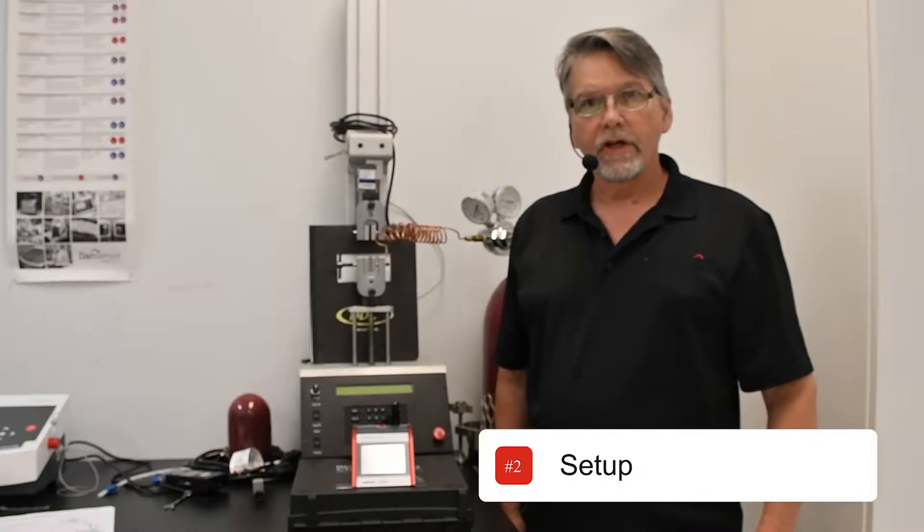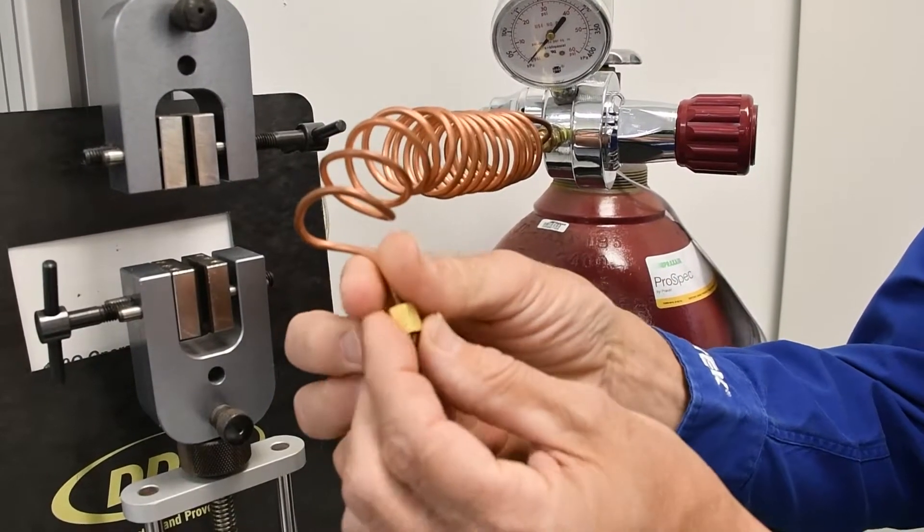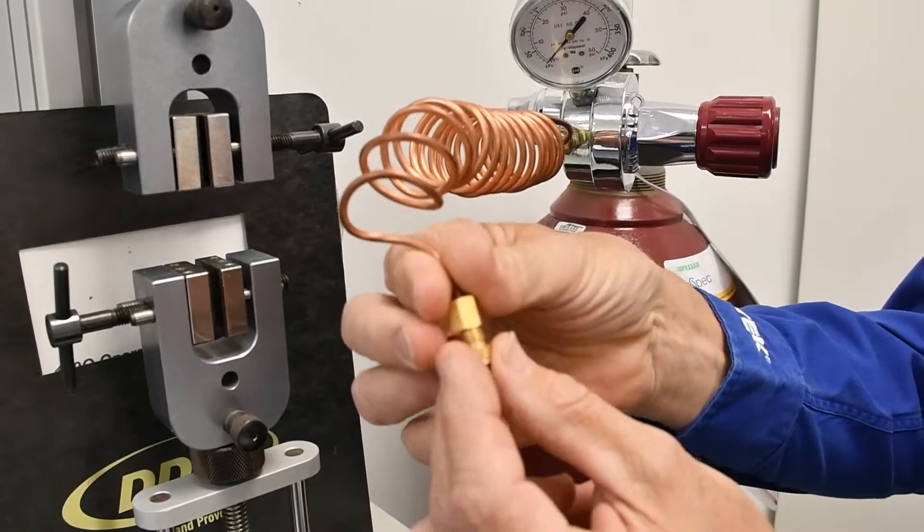Here's the setup for the Checkpoint 3. Connect the gas tank regulator to the pressure relief kit via nut, ferrule and copper tubing.